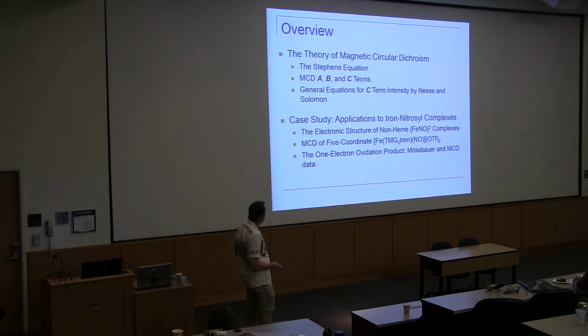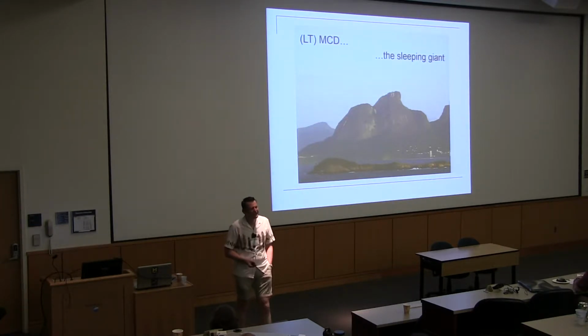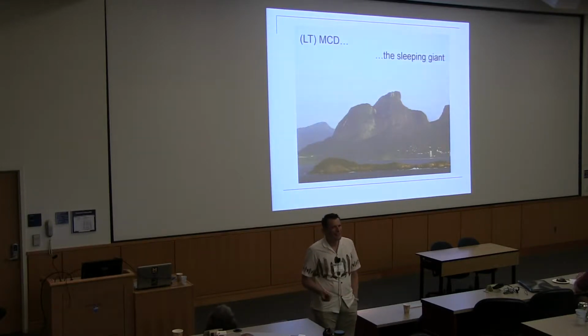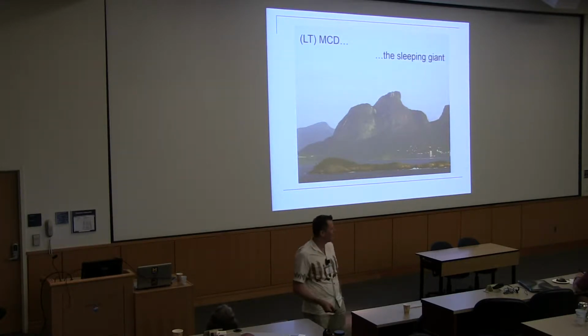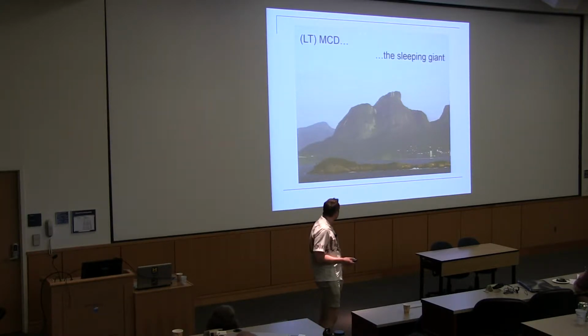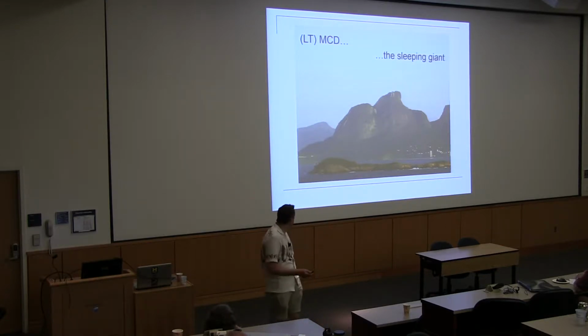So here's a slide that I always show: low temperature MCD, the sleeping giant. I think it is still a very underutilized technique in bioinorganic chemistry. I've been coming here a couple of times, as Carsten was mentioning, but I think this is still valid. There's a lot you can do, and you can learn about your system using MCD spectroscopy.